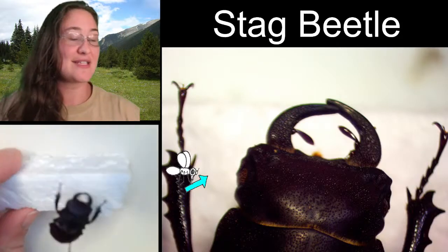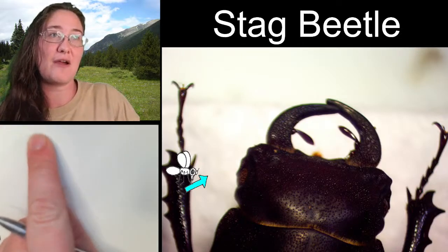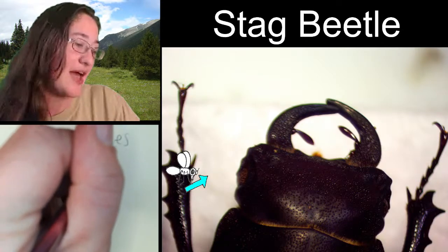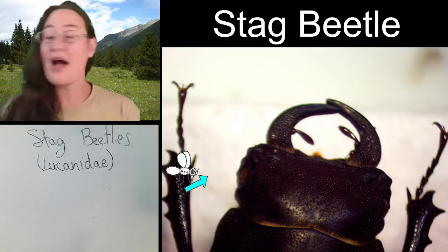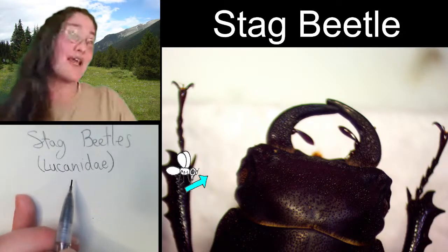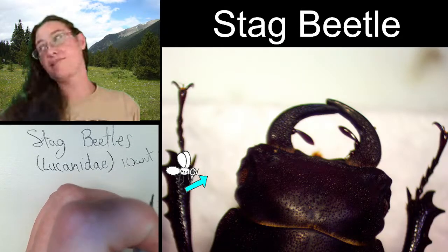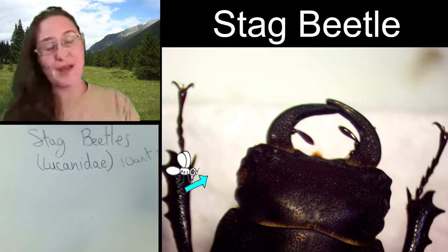So we are looking at this stag beetle, and admittedly I'm not exactly sure what species this is, but I do know the family because all stag beetles are in the family Lucanidae, spelled L-U-C-A-N-I-D-A-E. There are a couple of characteristics of stag beetles we can see every time we look at them: one is the tarsal formula and the second is the antennal type. All stag beetles or lucanids have 10 antennal segments, and a lot of times they're going to have a club at the end that is pectinate, meaning it's almost like a comb. You can't see the antenna on this specimen until we actually flip it upside down.